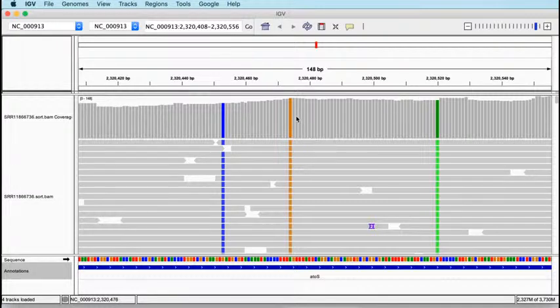And so this is relatively useful. We can use this information that's in the alignment about mismatches compared to the reference genome in a slightly more robust and statistical way to try and find genuine places where the genome that we've sequenced varies from the reference genome, which is something that we'll take a look at, not this afternoon, but we will take a look at.